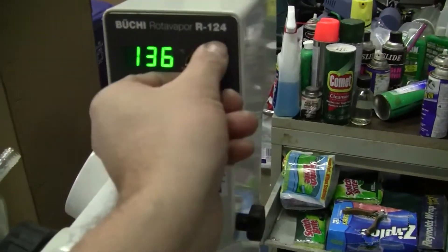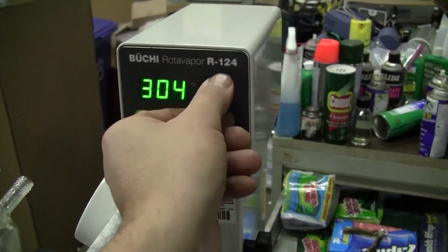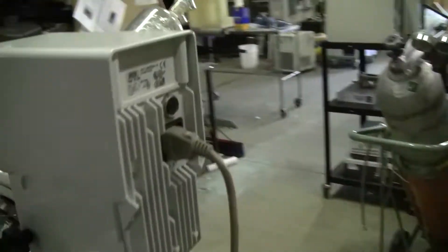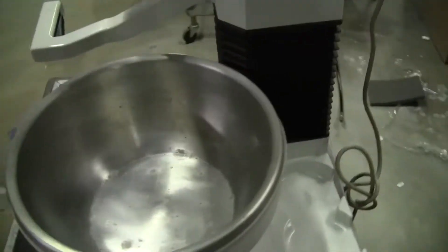It does have a sensor which is in the back of the accessory, which does not come with the unit. You can buy that separately to attach to the bath, but it's not needed for the operation.